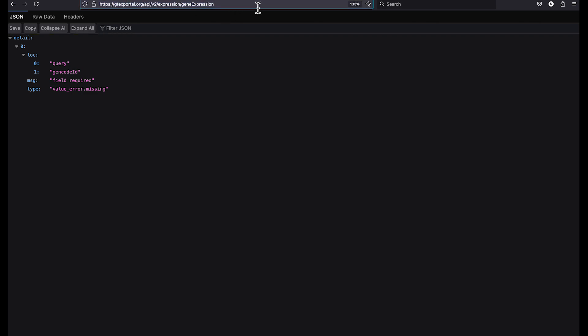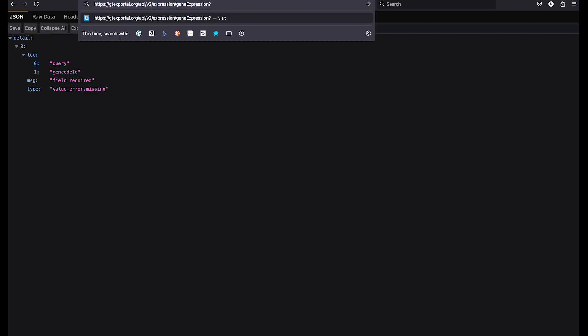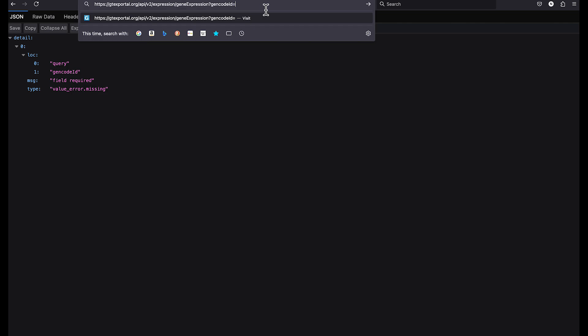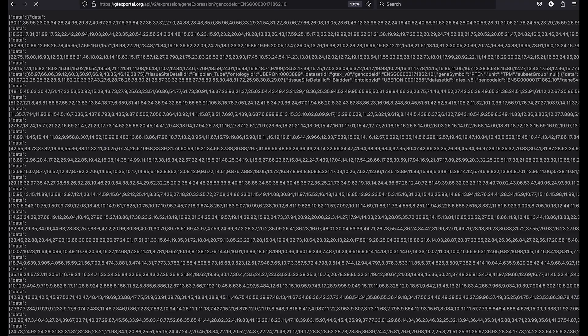So let's add the query parameter. We start with the question mark delimiter and then gencode ID, which is the query parameter name and equal sign. And now we will paste in a gencode ID. And as you can see, we received results this time.